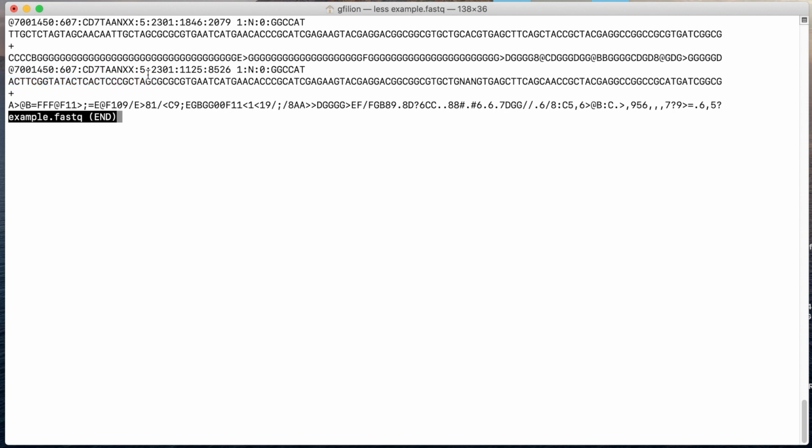Internally, the way this works in an Illumina sequencer is that 4 colors are recorded for each nucleotide. Each color corresponds to one particular nucleotide, A, T, G, or C. And depending on the quality of the signal, depending on how much one of the 4 colors shines over the others, a quality score is given here. So internally, each nucleotide is decoded based on the data of 4 individual values that correspond to the 4 colors that are recorded by the sequencer.